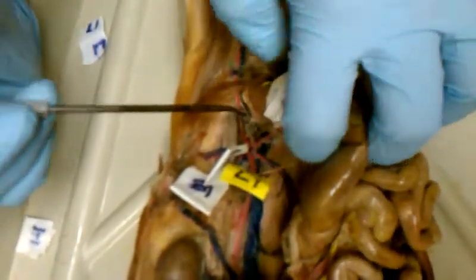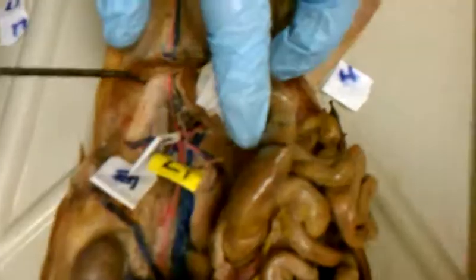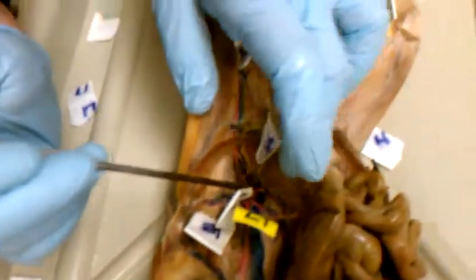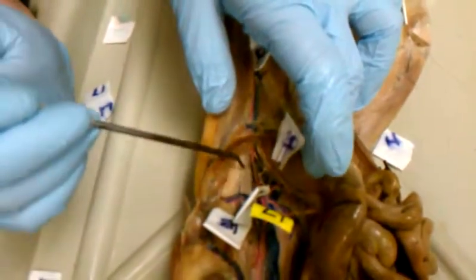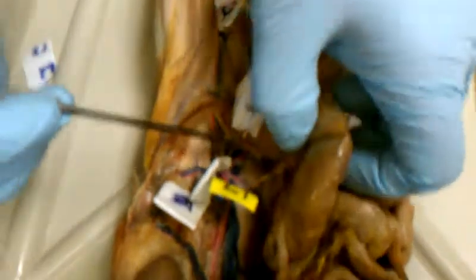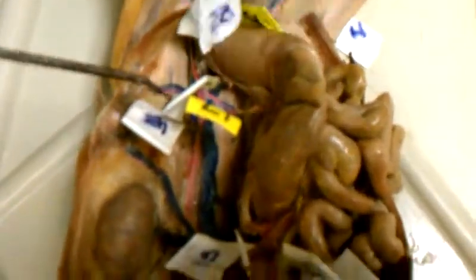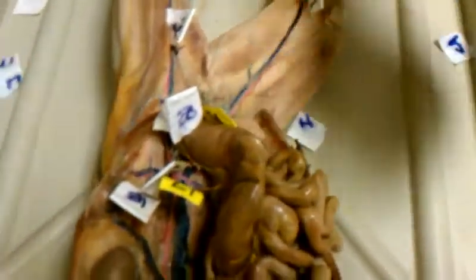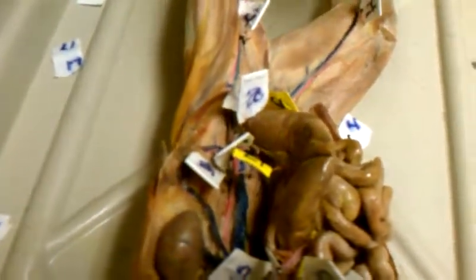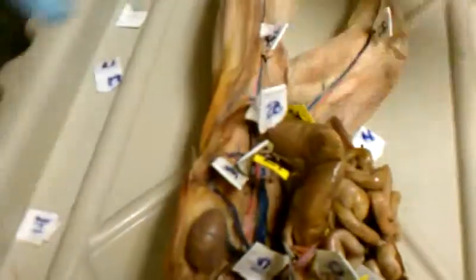Now is the fun part. Okay. So is 19 the external? I think 19 is the external iliac artery. Yes. 20 is the internal iliac artery. Yes, ma'am. And they kind of make a V. Well, no, they split off. They come off like that.